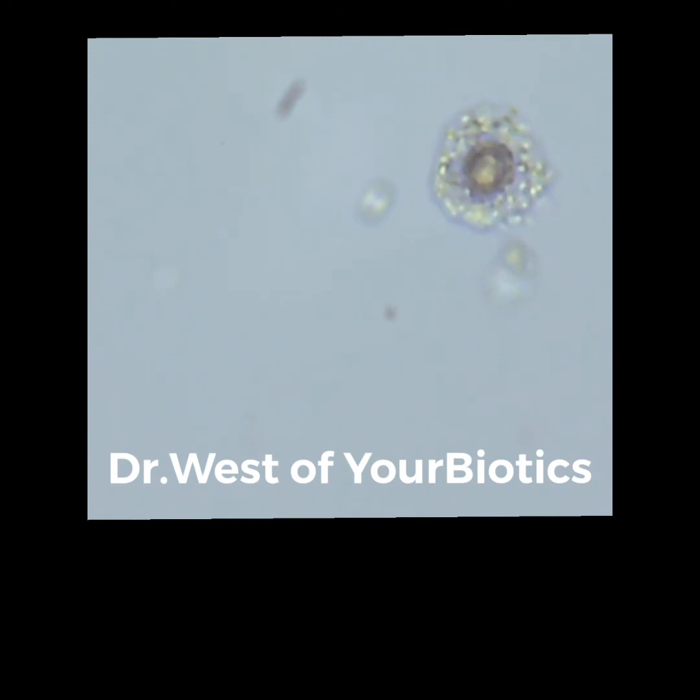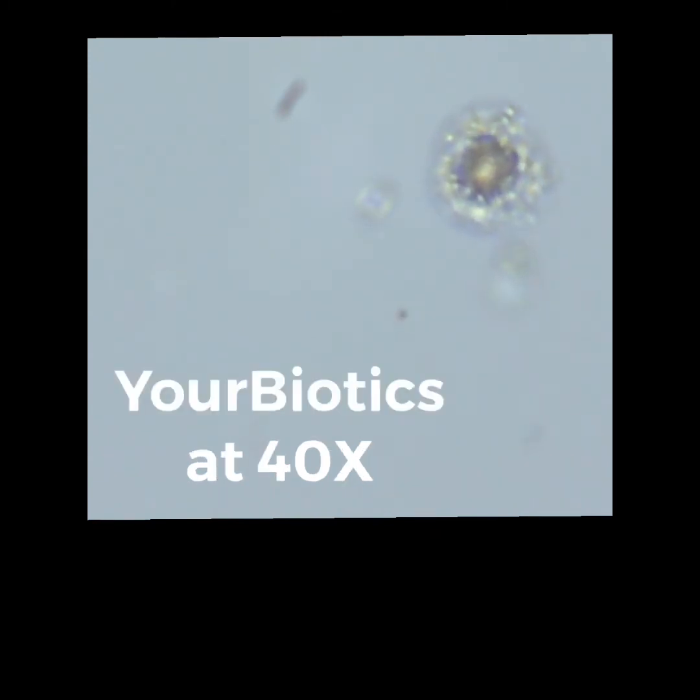Hi everyone, this is Dr. Jeff West and this is Your Biotics Underneath the Microscope at 40x.